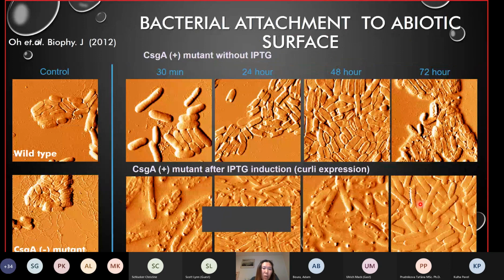And it can be applied not only to very small protein sizes, but also to bigger sizes, like the micro scale, which means 10 to 100 micrometers. And here is an example of how these bacteria form a biofilm on an abiotic surface. So with this E. coli, we grow the biofilm of E. coli on the glass surface.